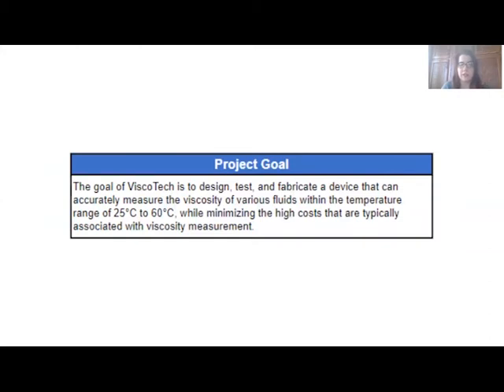Our goal was to design, test, and fabricate a device that can accurately measure the viscosity of various fluids ranging in temperature from 25 to 60 degrees Celsius, while keeping the cost to develop and run this device low compared to other currently used methods of measuring viscosity.